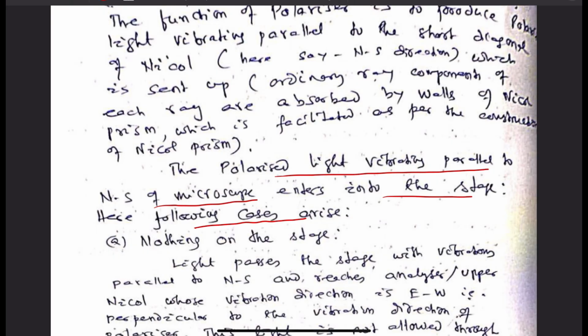What happens? Let us say nothing on the stage of the microscope, because it is generally seen that the polarizer and analyzer may have the facility to be rotated. So on many occasions they may not be available in mutually perpendicular conditions.